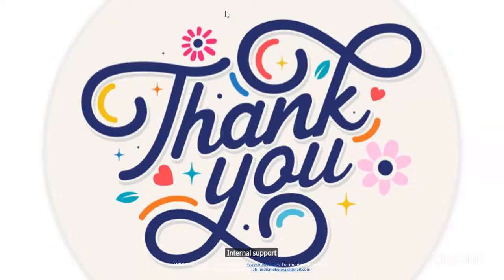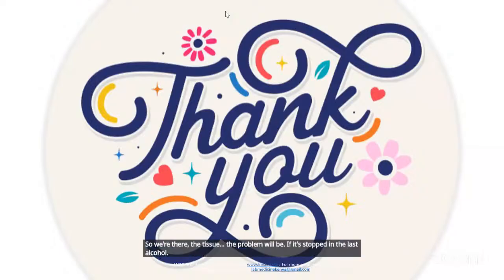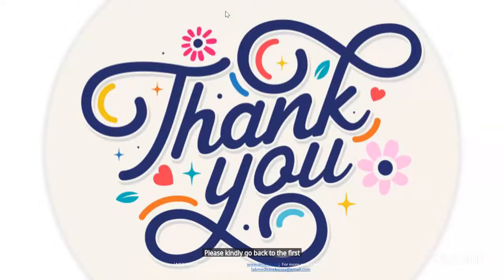But if it stops in xylene, that's where the problem will be. If it stops in the last alcohol, please go back to the first alcohol, which is around 70%, then start again, because that one can over-harden the tissue. Hope I've answered you. Yeah, thank you.